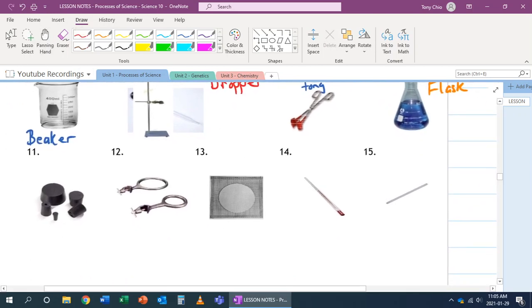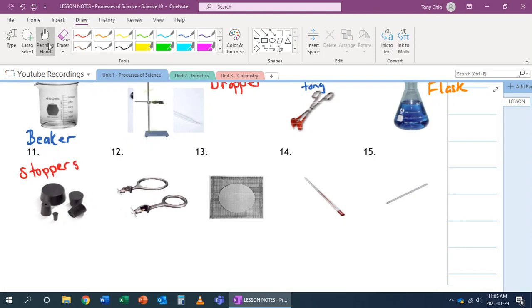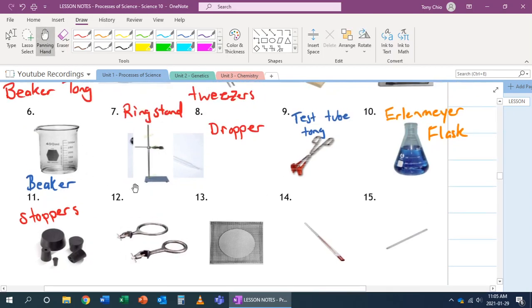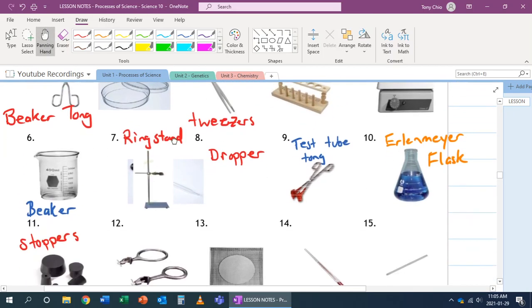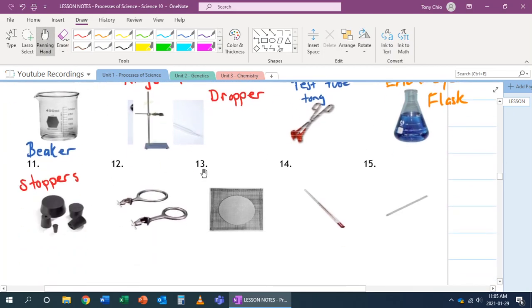Number 11, these are what we call stoppers. Some people, if they're made up of cork, they're called cork stoppers. And what they're used for is to stopper certain items we have. For example, test tubes, Erlenmeyer flask, and so forth.